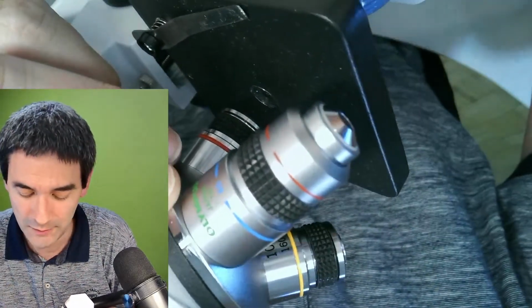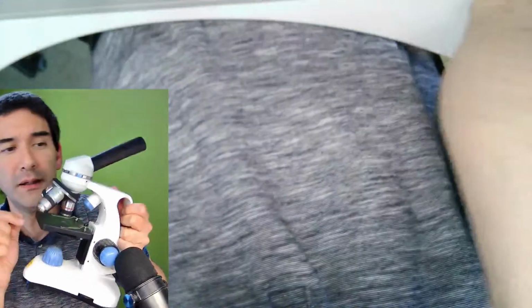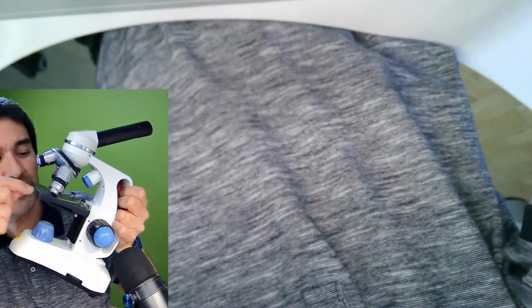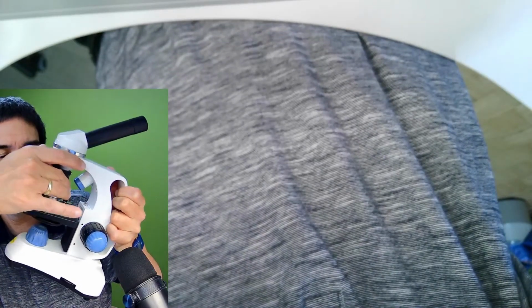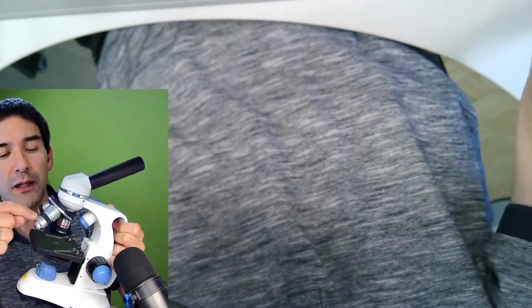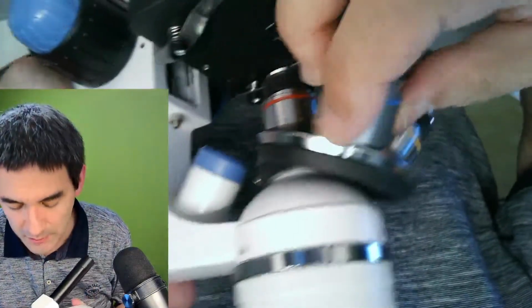Or not. Be careful. Yeah, no, it doesn't work. And the reason is the following. I'm going to hold it up again. Is this because it's too large? Yeah, you see? It crashes against the stage. And even when I lower the stage, the distance is not right. So that's one of the problems that I found, that this is too close. So the problem is, even though it fits physically in here, I'm not able to use it, even though it's still a 160 millimeter objective.